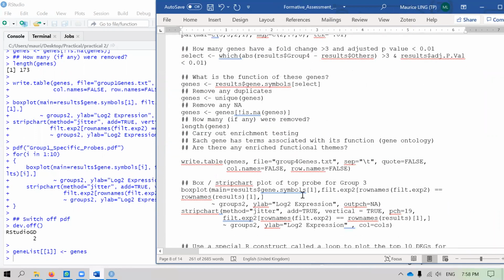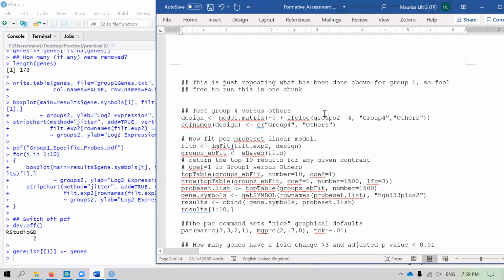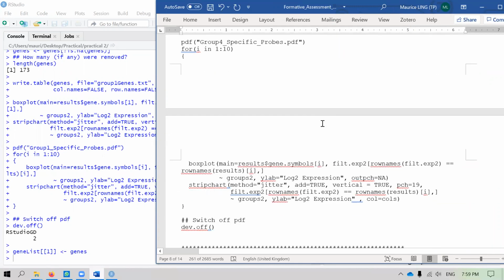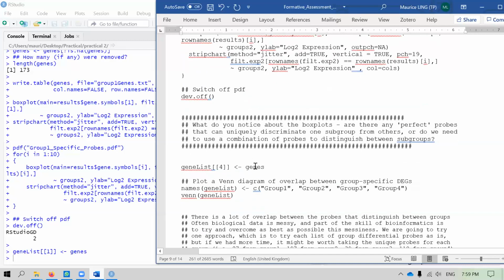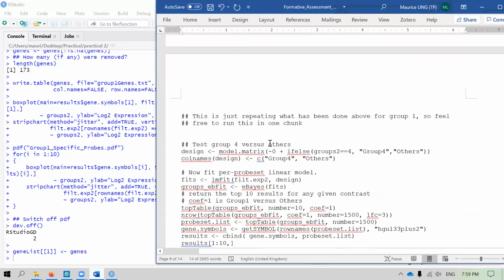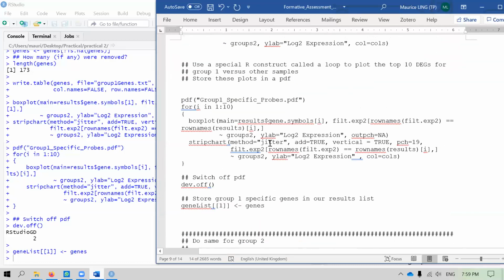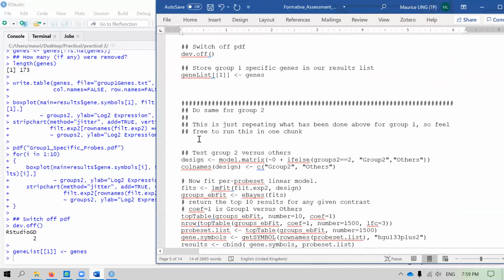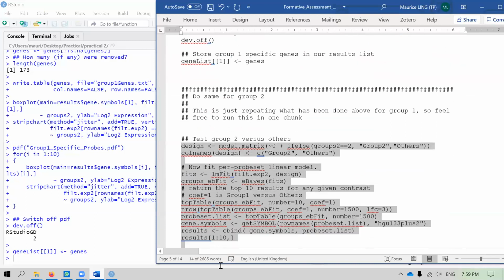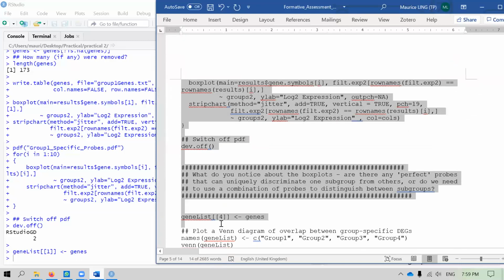So it's the same thing. I just change the matrix. Okay. So now group 4, and see, I put in group 4. So I can redo this whole set from 1 to 2, 3, and 4 together. Okay, I don't have to keep repeating it. So I do from group 2 until group 4.